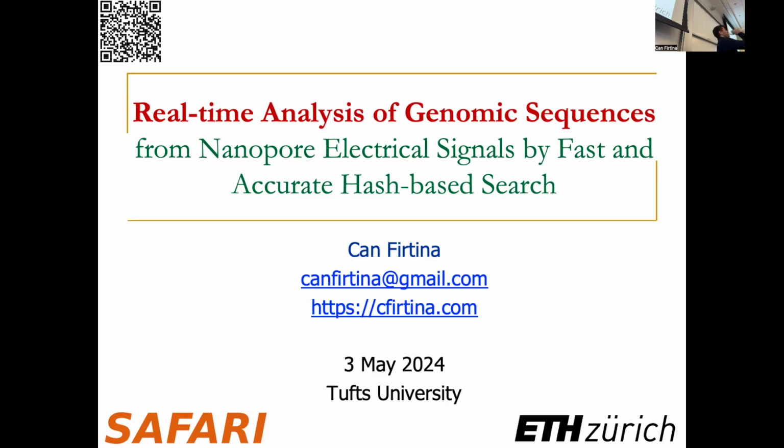Yeah. So my first question is an algorithms question. When you're aligning to a reference genome, and because of personalized genomics, you're going to see a lot of SNPs, right? So my question is, for your hash values, have you done anything to hash things so that nearby k-mers hash to similar values?